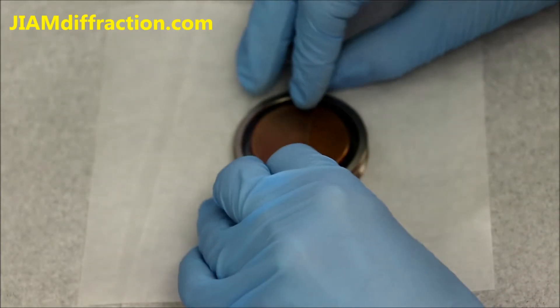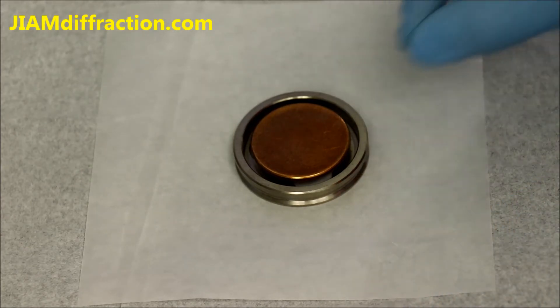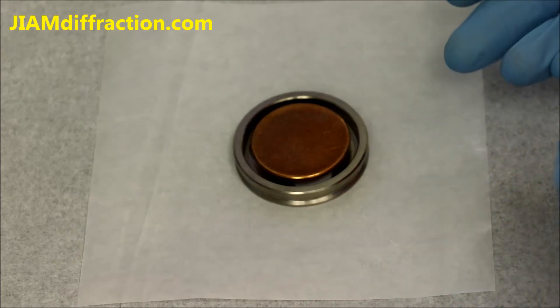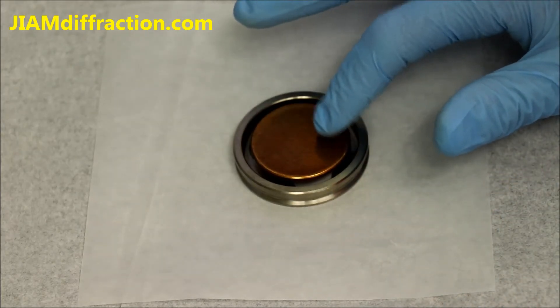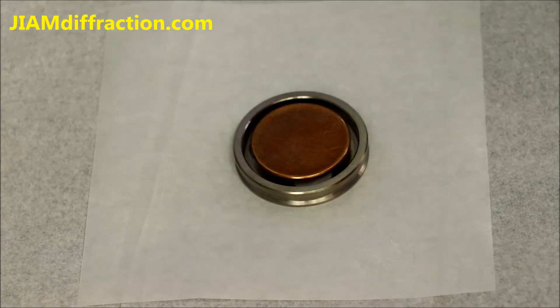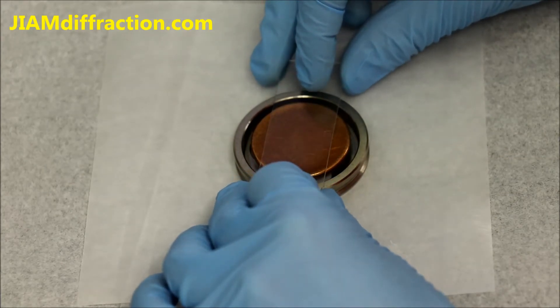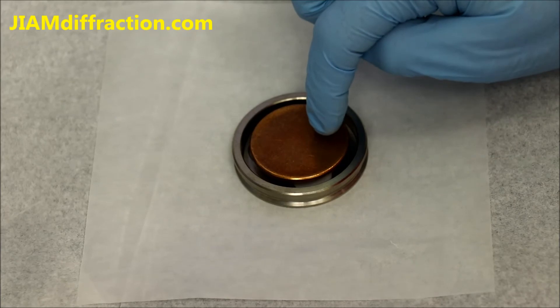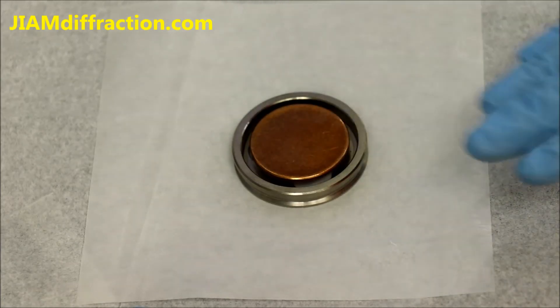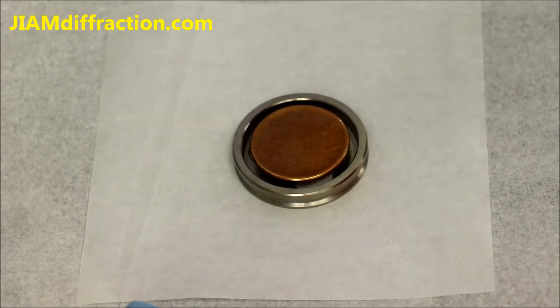I like to press down on the slide where it contacts the outer ring. Once it's nice and level, that's pretty much all of our sample preparation. If you had a much smaller sample and wanted to use this holder, you could replace this with a zero background plate. Put your sample in the center, press down, and that will make the sample level with the outside ring — the zero background plate will sit a little bit lower, but it's the top of the sample that we want level with the outside ring.